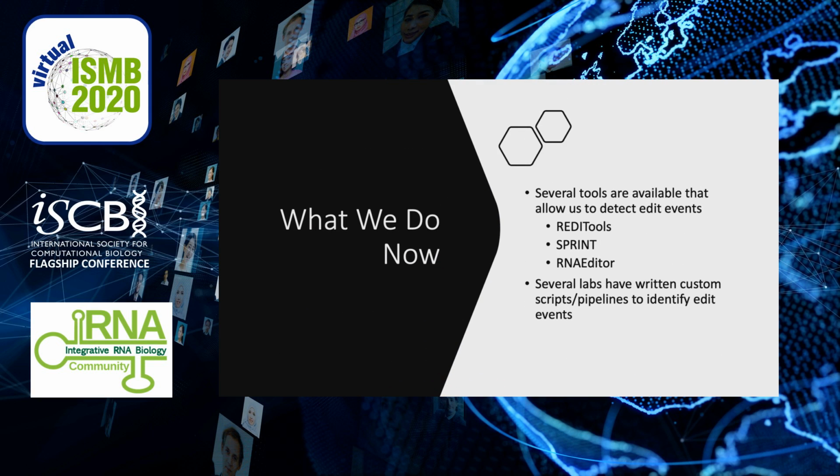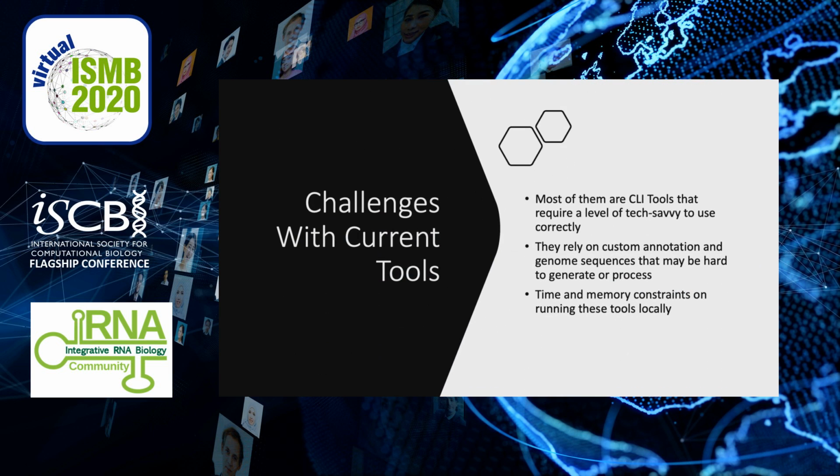There are several tools available that use sophisticated filtering and advanced analyses to find potential editing sites. Many labs have written their own custom pipelines as well. However, there are still a few problems with the existing tools. They are CLI applications and require a level of tech savvy to use correctly. They also rely on several specific annotation files that have a custom format or that may be harder to generate. Finally, the memory and processing constraints can sometimes be prohibitive.